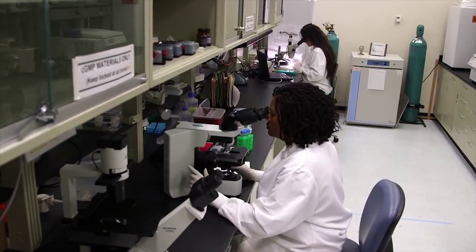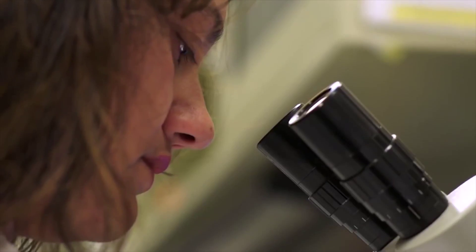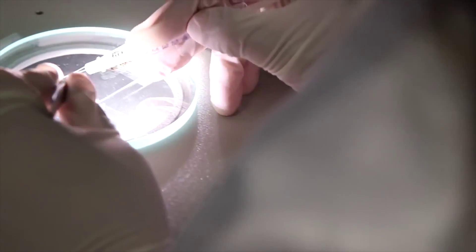Right now, the way that we get these parasites out of the mosquitoes — the speed and the precision just by dissecting them out by hand is phenomenal, but we want to make it better. Good is not good enough.